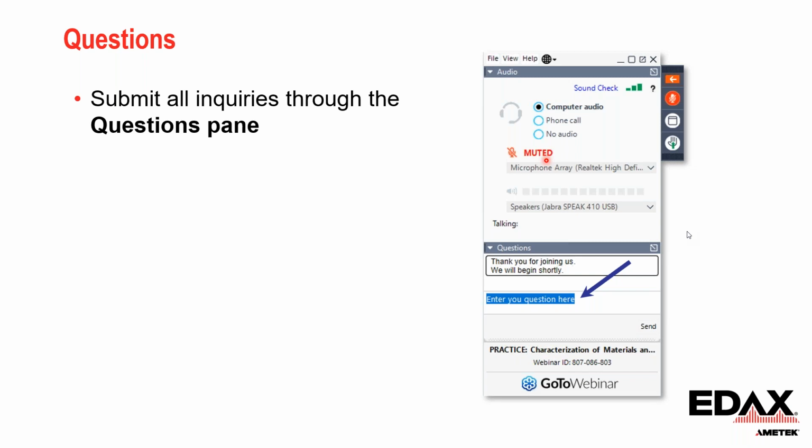And on the EDS side, let me start from the basic physics. Actually, the lithium K X-ray, from the L to K shell, is not an allowed transition. So the likelihood of X-ray emission is very low. So we don't have lithium generation in the first place.